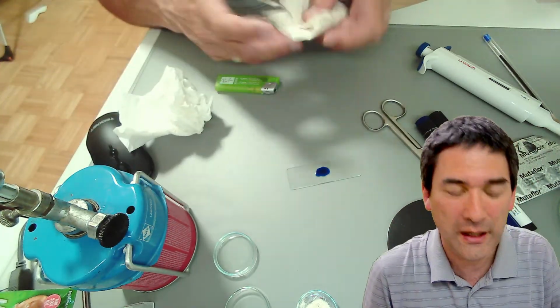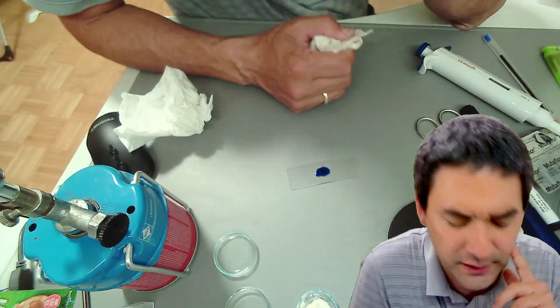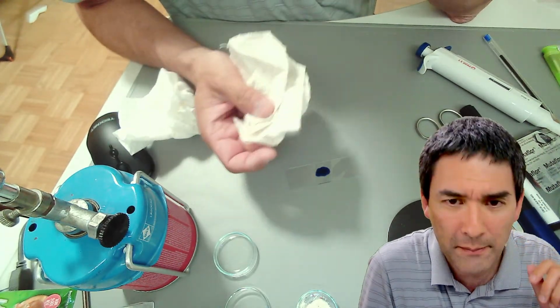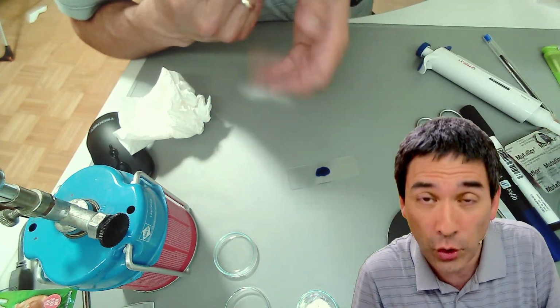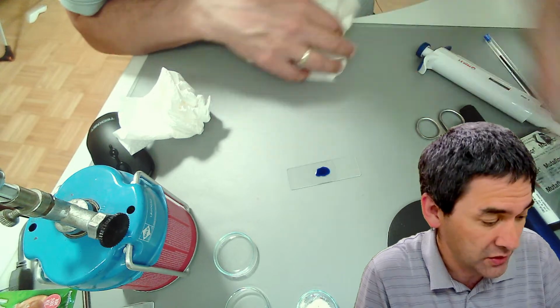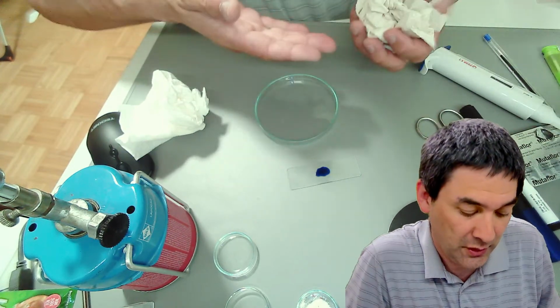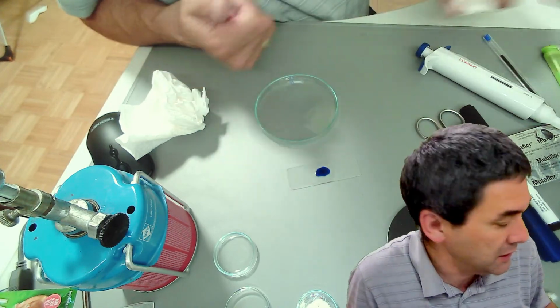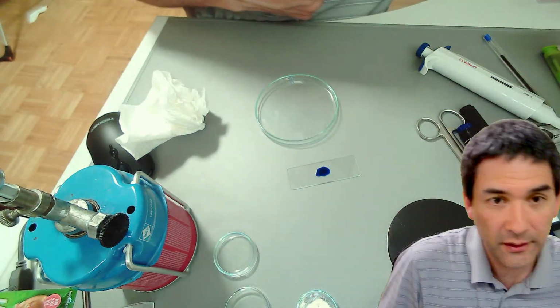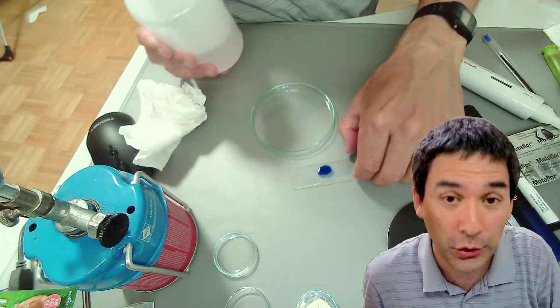Because what I'll be doing now is I have to remove the stain again. Now the question is, how am I supposed to do that? I cannot wipe it because then I'm going to probably scratch off the bacteria, right? So I need some way to actually get the stain off without touching the bacteria, and there is an easy way to do that, and that is also the reason why we heat fixed it, because they will not be washed away.